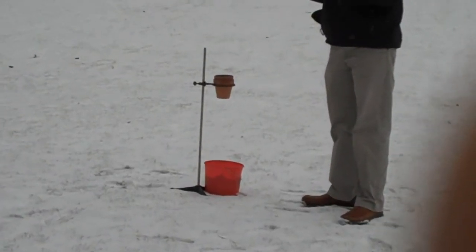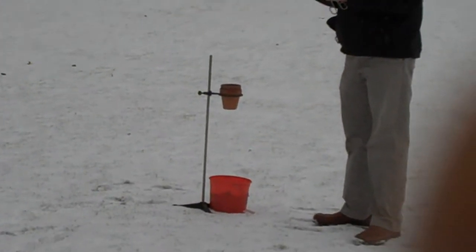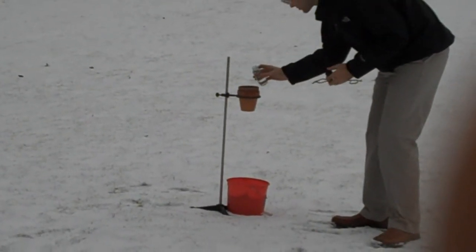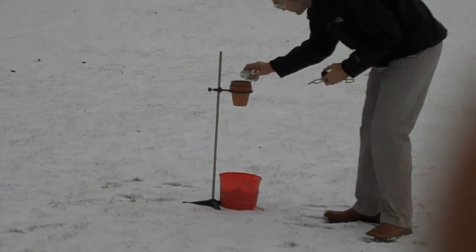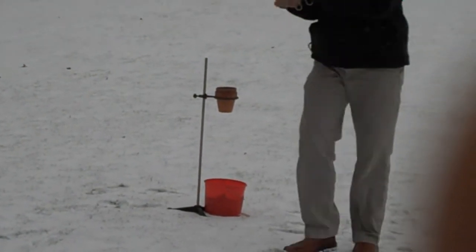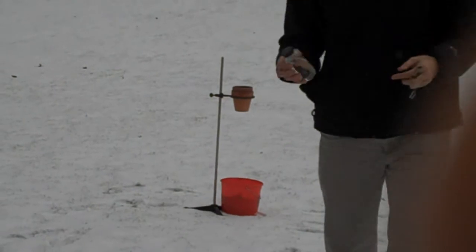Now, all I'm going to do to start this off is pour a little bit of glycerin. Glycerin is just something that we use as a lubricant in the chemistry lab to put thermometers and stoppers at the surface. It's about 10 milliliters, plus or minus a few milliliters.